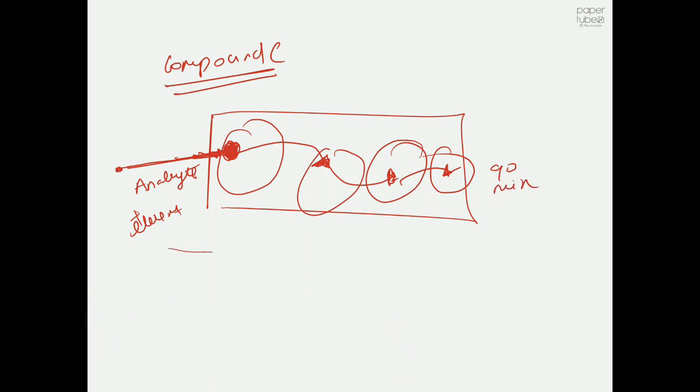So this is the general idea. And this is the easiest way to understand what's really happening in the chromatography column. So see, if you want to put it simply, once you add the solvent, in this case the mobile phase on the top, it will dissolve your compound, and the dissolved phase will move through the column.